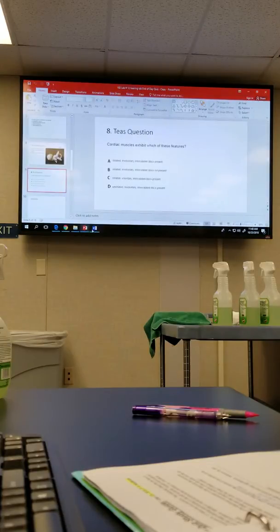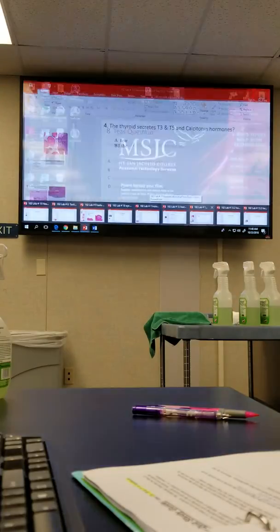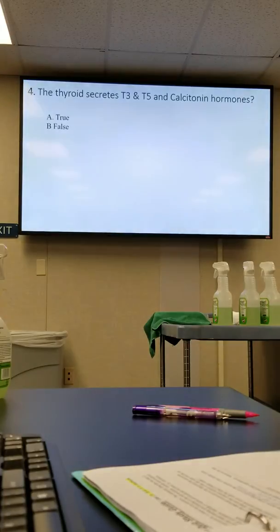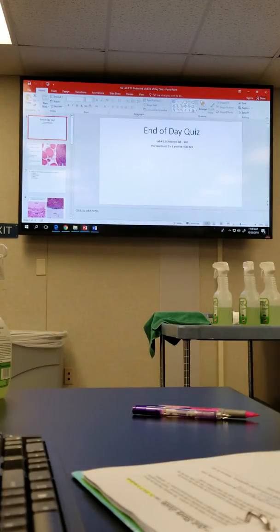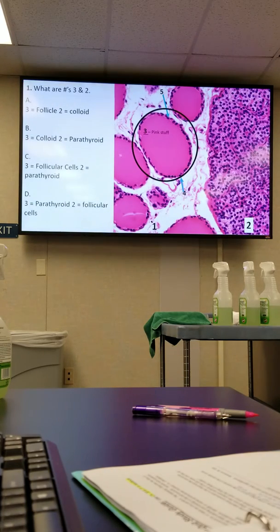All right, let's see. Okay, these are hormones. These are the different hormones. Go back to the beginning. All right, these are talking about these cells when we went through the hormones and all the charts on that, the endocrine chart. You gotta know what the pink area is called. You need to know what that is. You need to know what the outside of this is.